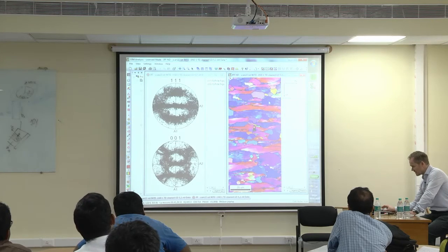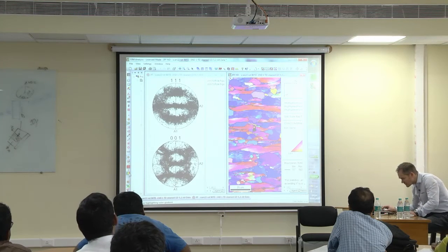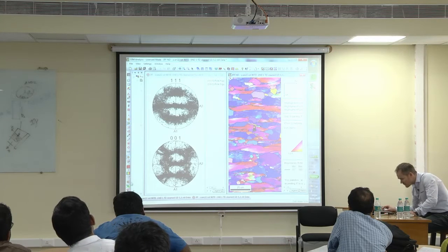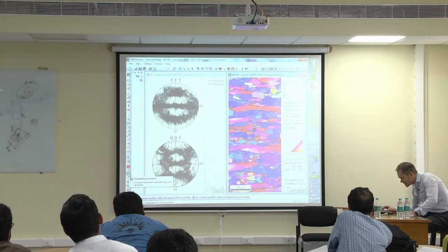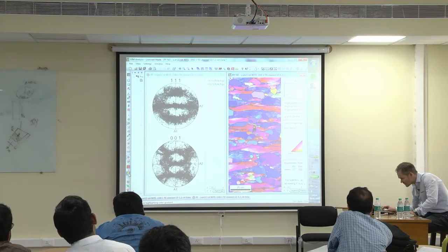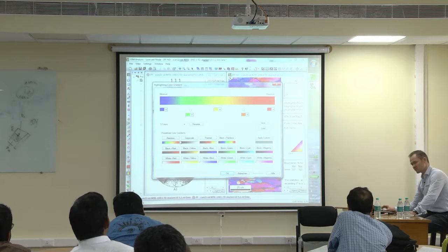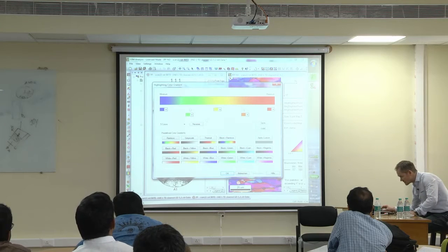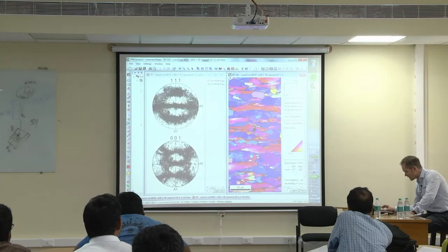And the software is now coloring that, and it should color it also here, and it does actually, but it's not so well visible. And it's also not so well visible because the color coding here is not so fantastic. I think I need this one, yes. Blue, should we take blue? In order to see it better, I don't take blue, I take yellow, reverse, okay.